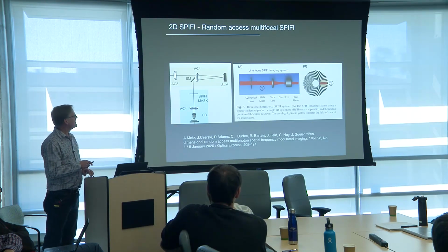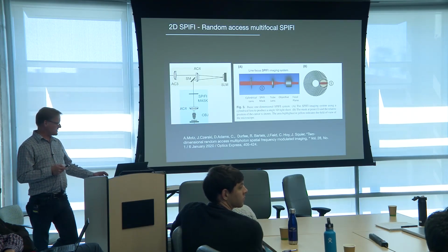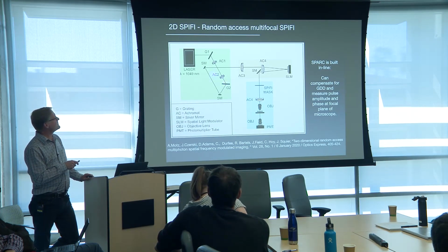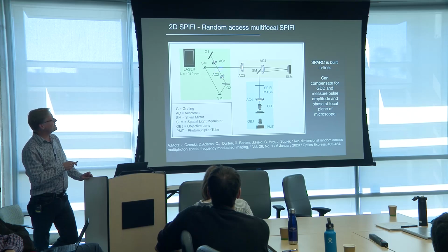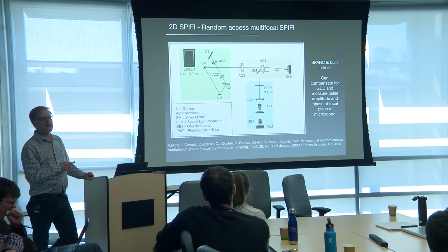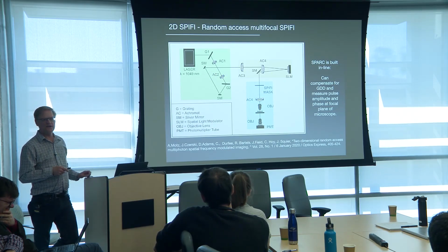While you are spinning the disc. No, actually no, because you're not. Where is the slit though? So that's where the slit is. It's designed to be popped in and out. It's not shown there, but you put the slit in. Your SPIFFy mask is aligned, so you're allowing all the light through.